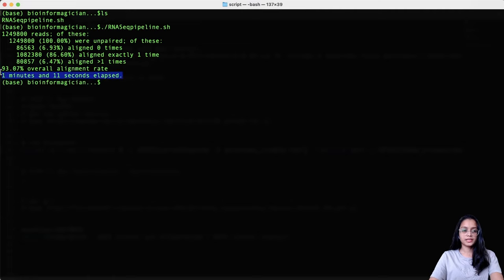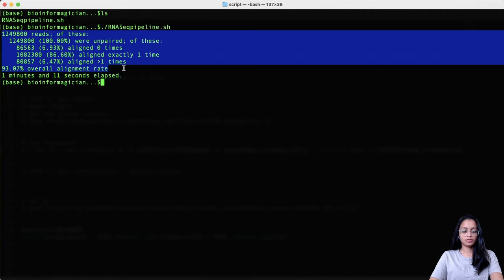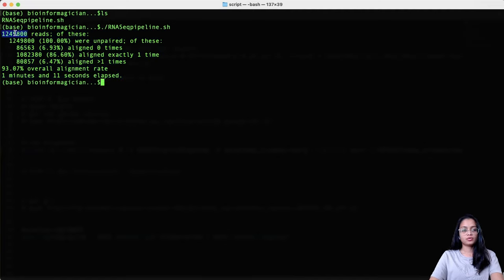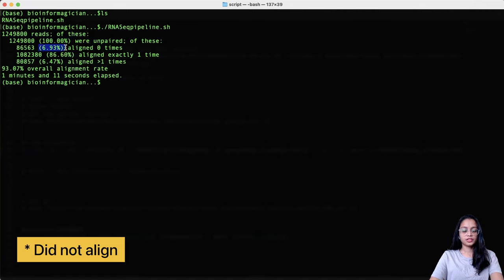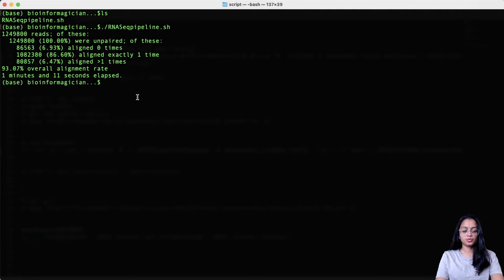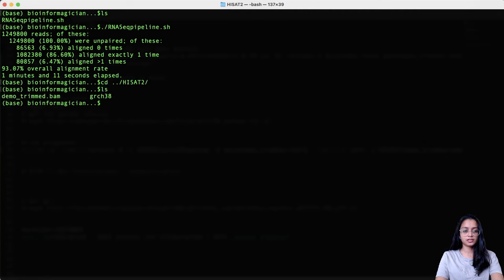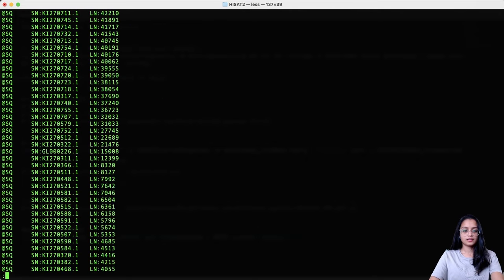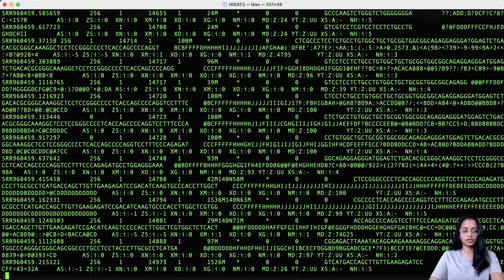HISAT2 has finished running — it took 1 minute and 11 seconds. The alignment summary shows: out of the total reads, all were unpaired (single-ended). 6.93% of reads aligned 0 times, 86.60% aligned exactly one time, and 6.47% aligned more than one time, giving an overall alignment rate of 93.07%. Going to the HISAT2 folder, we can see the demo_trim.bam file was created. Taking a quick look at the BAM file shows the header section and read alignment information.